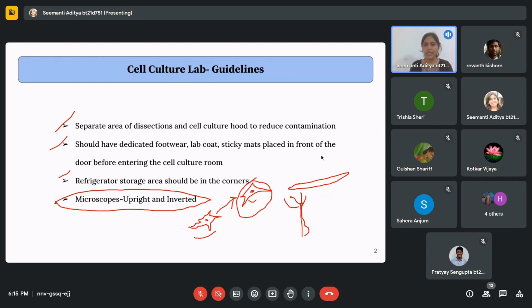One reason could be that the cell culture incubator is not maintaining proper conditions, like it is not maintaining the carbon dioxide level, or it is not maintaining the temperature. That could be one reason. Another reason for cells getting stressed is that they are contaminated.